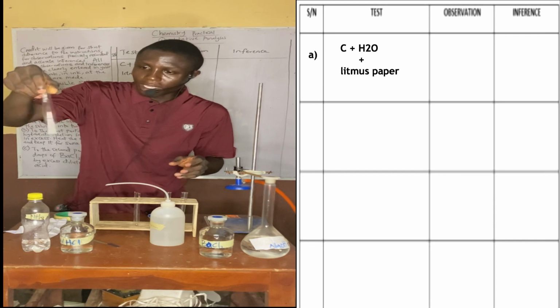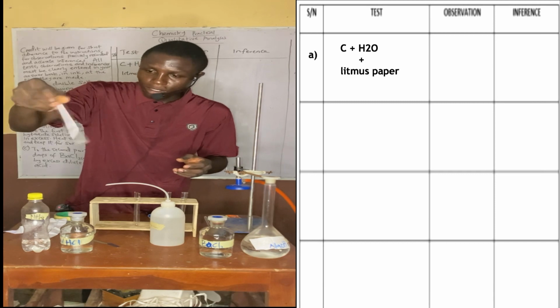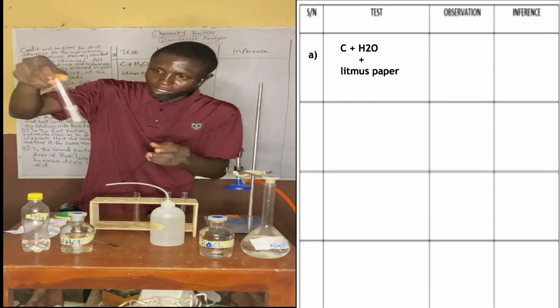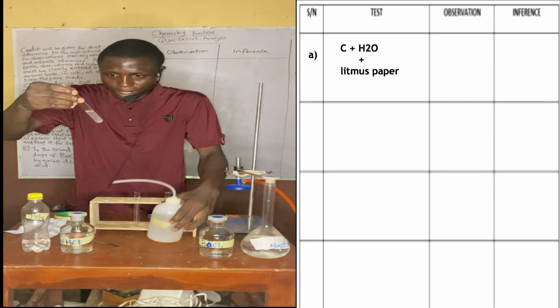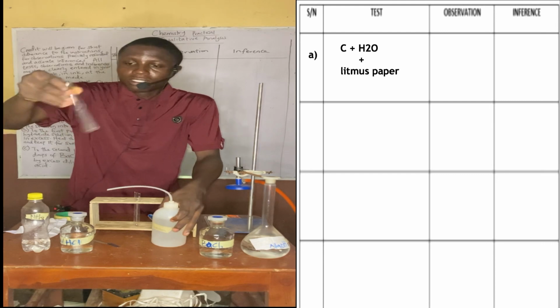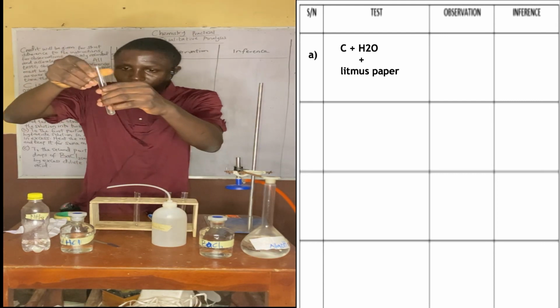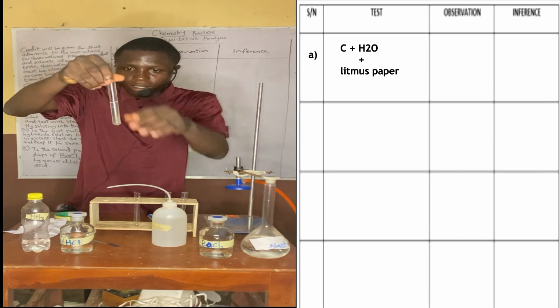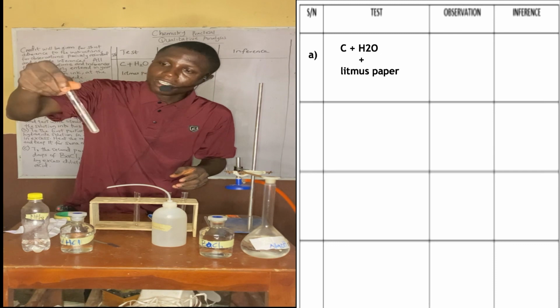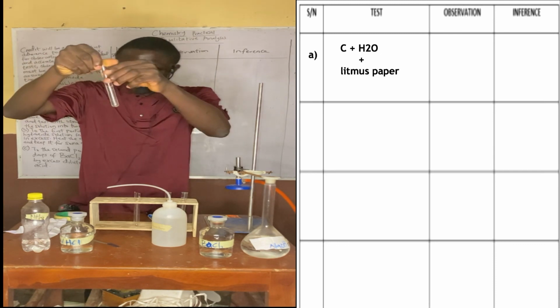As you add the water to it, then shake, so that you ensure that the salt dissolves. Let me add a little bit of water. Don't forget that it's about 5 centimeter cube. You can see the salt is gradually dissolving. Now the salt is dissolved, meaning that the salt is a soluble salt.